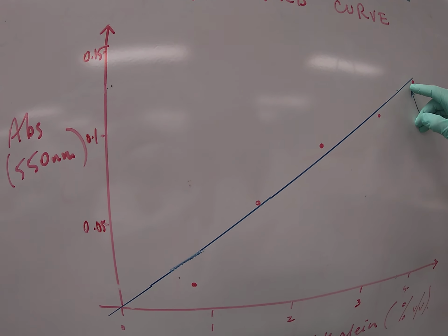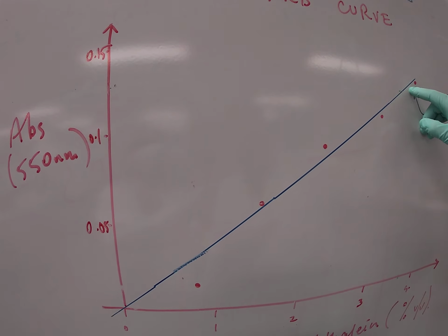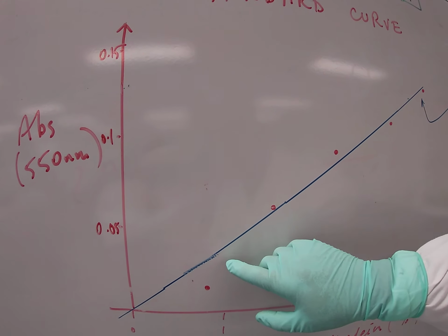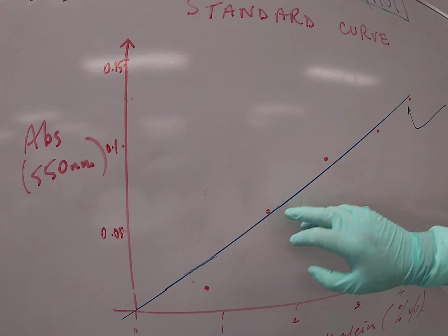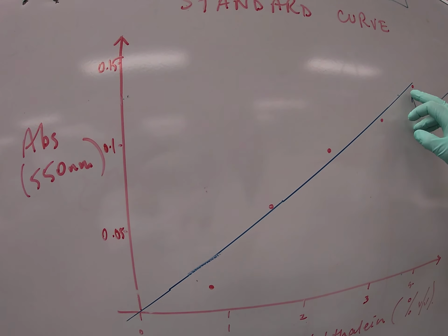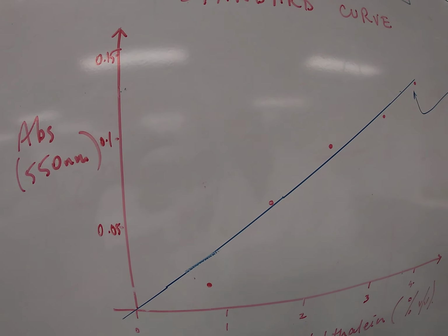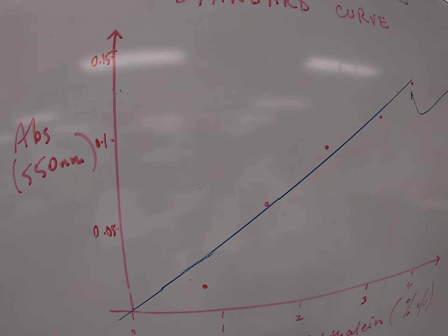But due to Bob's technique or other variables, these points don't line up perfectly, which is what you'd expect in a real world situation. Not too bad, Bob. Thank you.